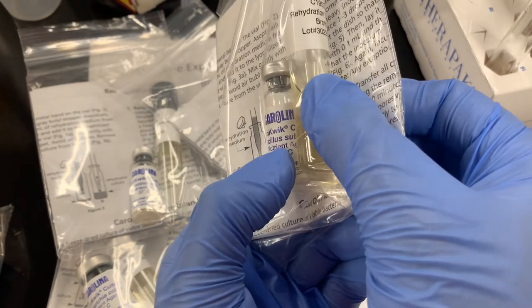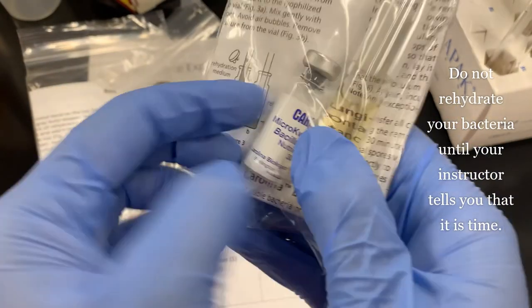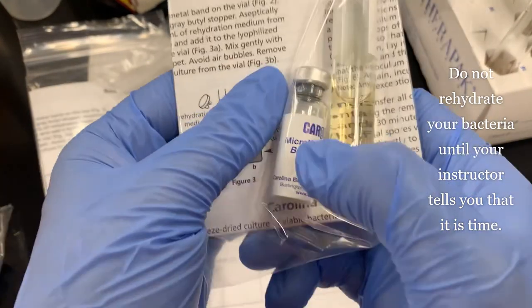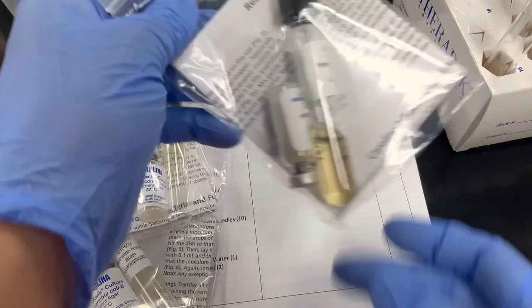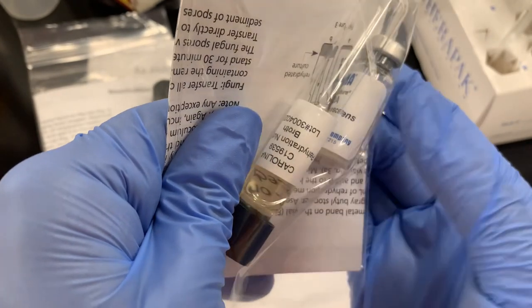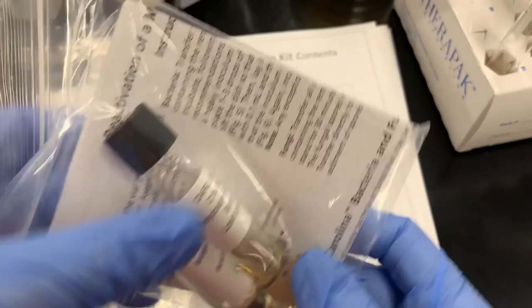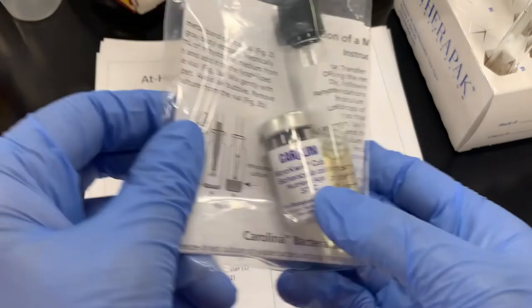This says Bacillus subtilis. You should be able to tell. You can open the pack, I'm not gonna open it here, but you can open the pack and you can read. MicroQuick Culture says Bacillus subtilis. Great, you have 1 of those. Then you're gonna go over here. This says Serratia marcescens. It's hard to see. I know what it says. It says Serratia marcescens. This one says Staphylococcus epidermidis. And this last one says Escherichia coli, okay?